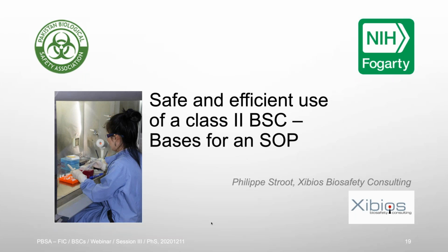So in the second part, I will present the basis for an SOP, a standard operating procedure. An SOP is what is needed for operators to know exactly what to do, in what order, and so on, in order to, in this case, use a Class 2 biosafety cabinet.